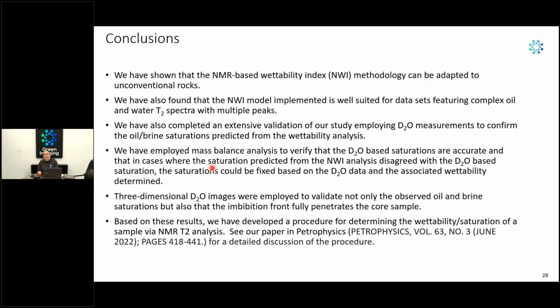And we've developed a procedure. I didn't share it, but if anybody wants to do this work, we've developed a step-by-step procedure on how you should proceed if you want to do one of these NMR wettability T2 analyses. You can see our paper for a fully detailed discussion of this procedure. So that's the end of my talk.